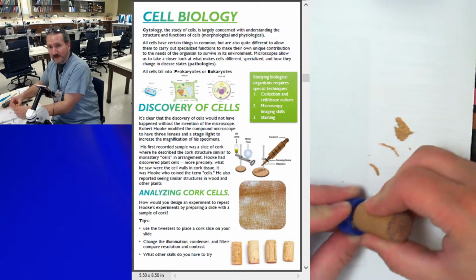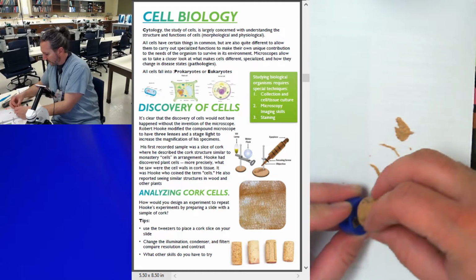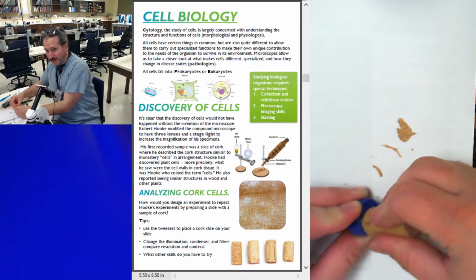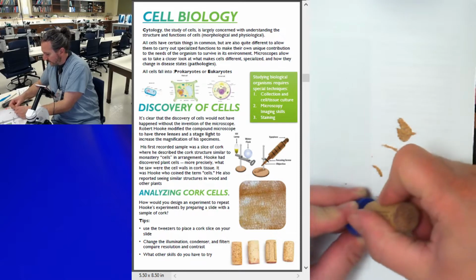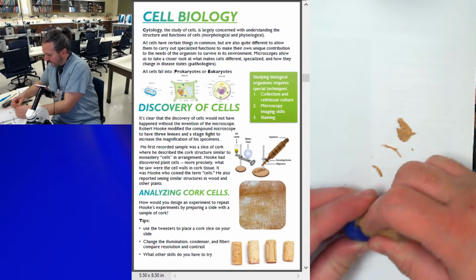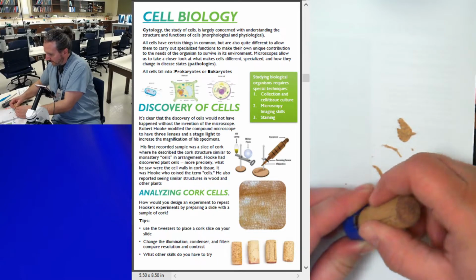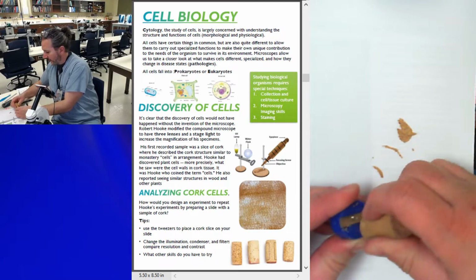I can feel it. You can kind of feel the roughness. It's like when you sharpen a pencil. There we go. Lots of little tiny shavings. I'm just kind of curling it in. I'm trying the different sides because I noticed that the bevel on this sits a little bit lower. This one sits a little higher. So this top part is taking a little bit bigger pieces. Bottom, not so much.